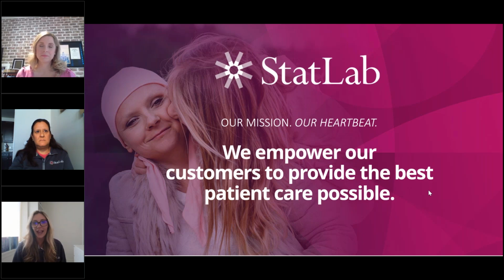While you guys are doing that, we did have a question come in from Juan asking what kind of slide would be best to use for toenails. I know you guys were talking about some of the harder tissues being better for those higher adhesions or tissue wash. Do you guys have any suggestions, or does anybody else on the call have suggestions for the best slides for toenails or nails?